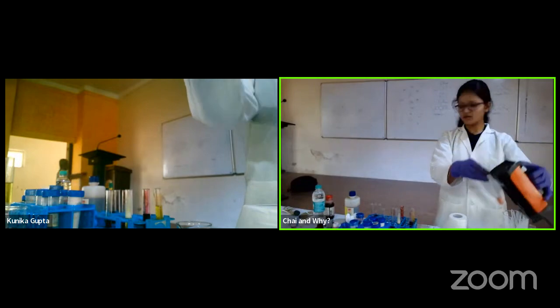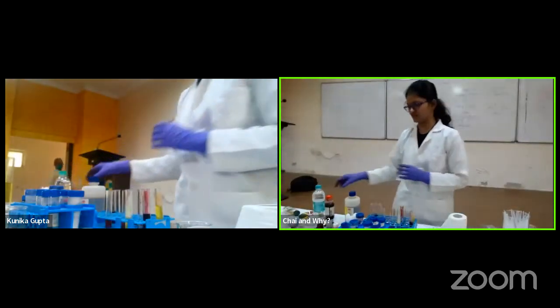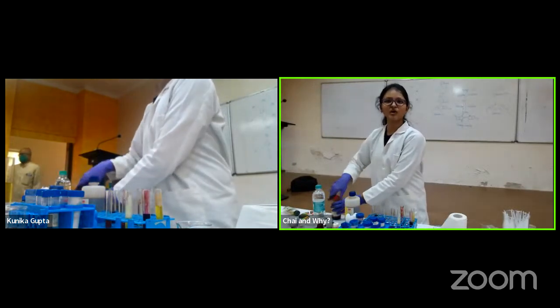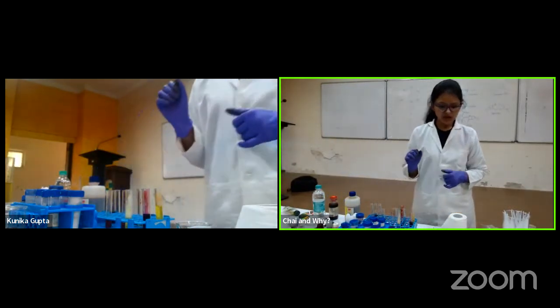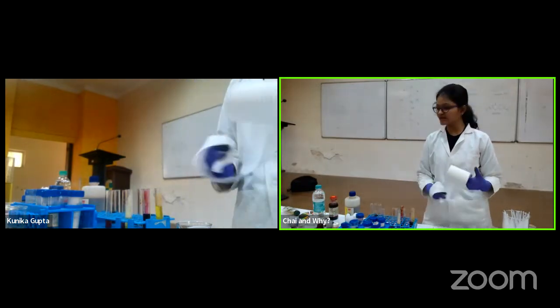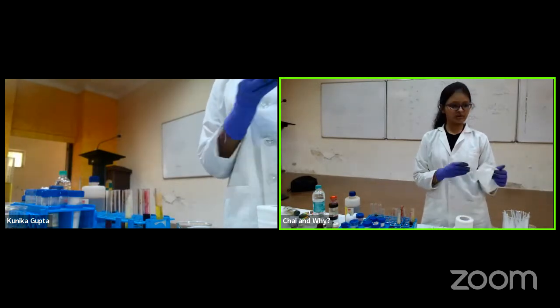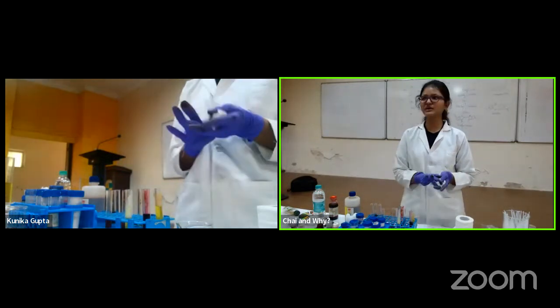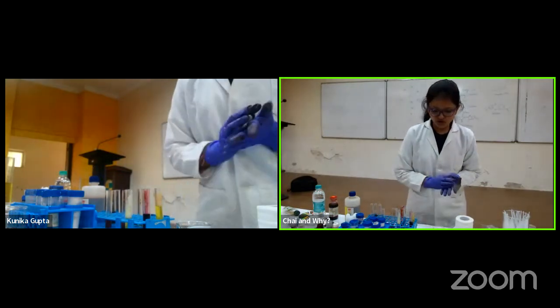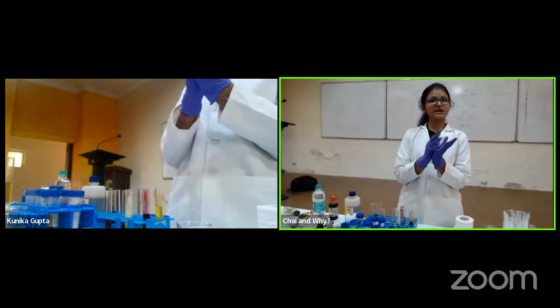How we make dye. So it's not as simple, because what I did now was I randomly kept adding things. I didn't even bother whether there would be a little less or a little more. But I don't want it to actually happen this way, because when I am doing a reaction it requires a lot of effort. As I told you, it's not how we do it because it will spoil the chemicals, and we don't want a big container for one reaction, right? Eventually it costs money. So this all has to be done very precisely in a reaction vessel, which is a dry setup.